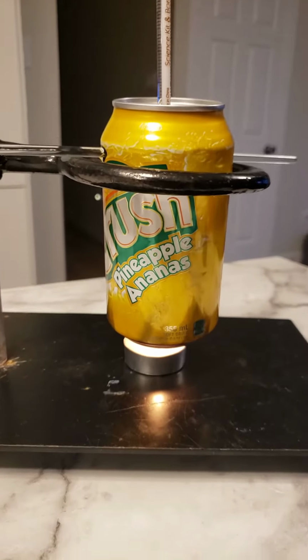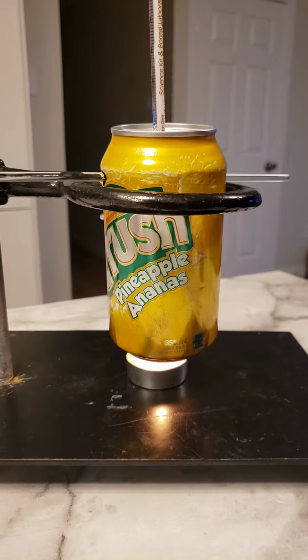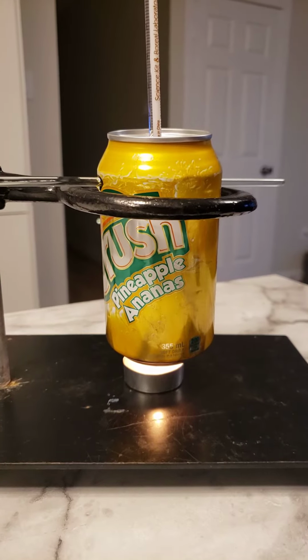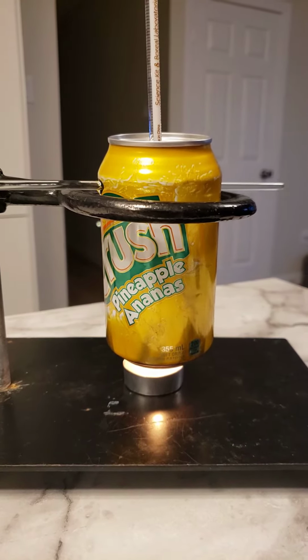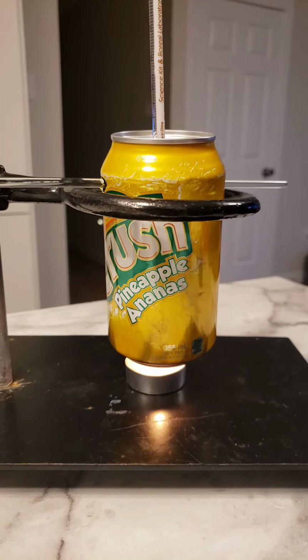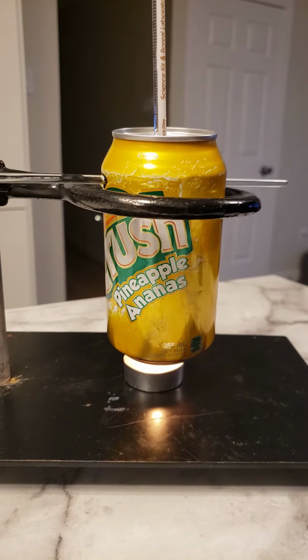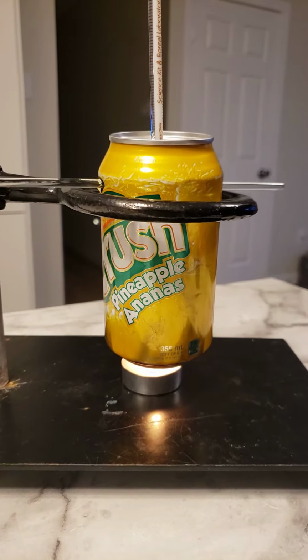Okay, so the candle's lit down there, and it has the can only above it by about a centimeter, because we want all of the heat of the paraffin wax burning being transferred to the aluminum can and the water inside, which together is mocked up to make a bomb calorimeter setup.